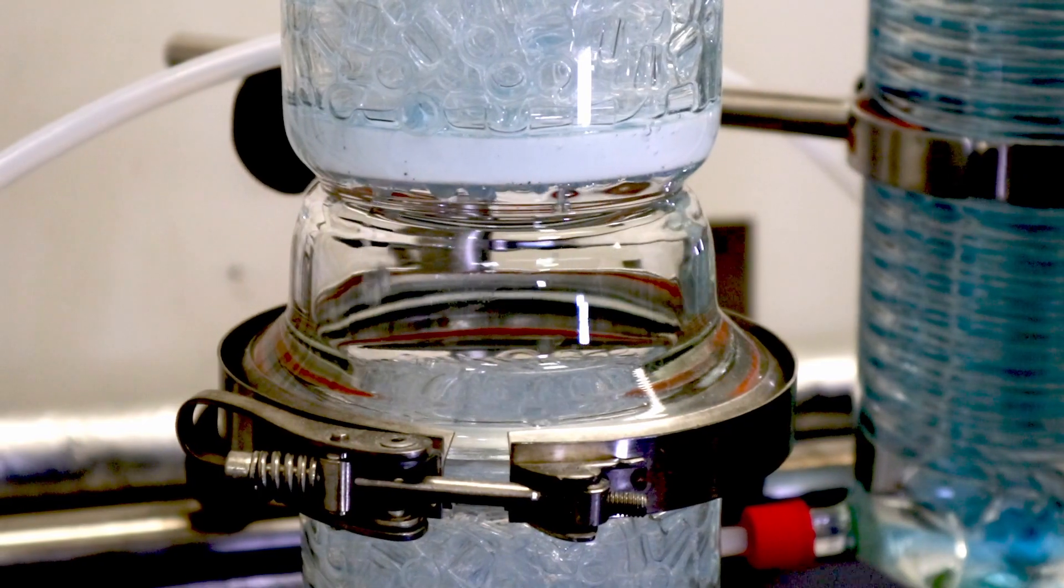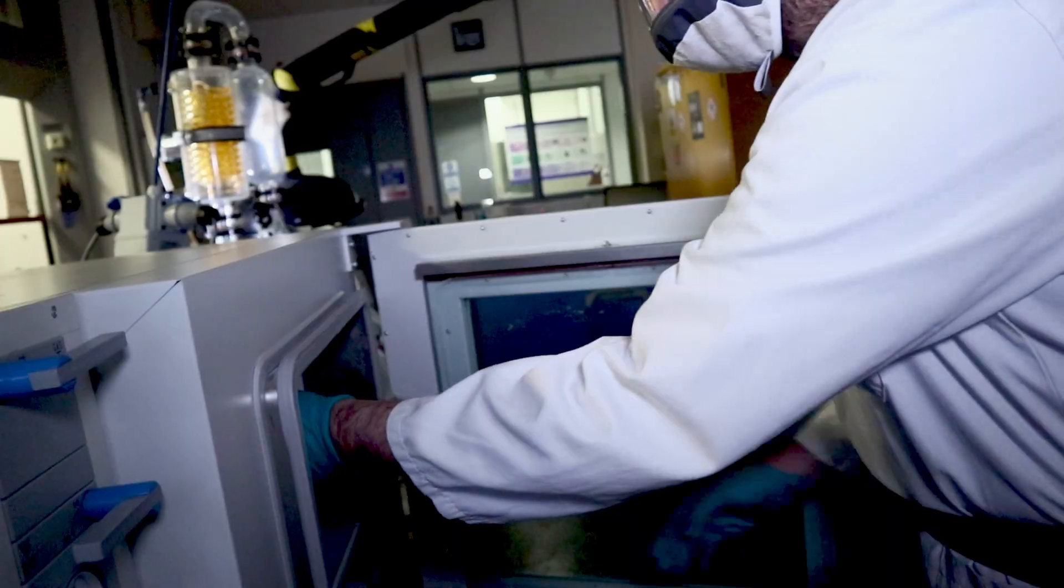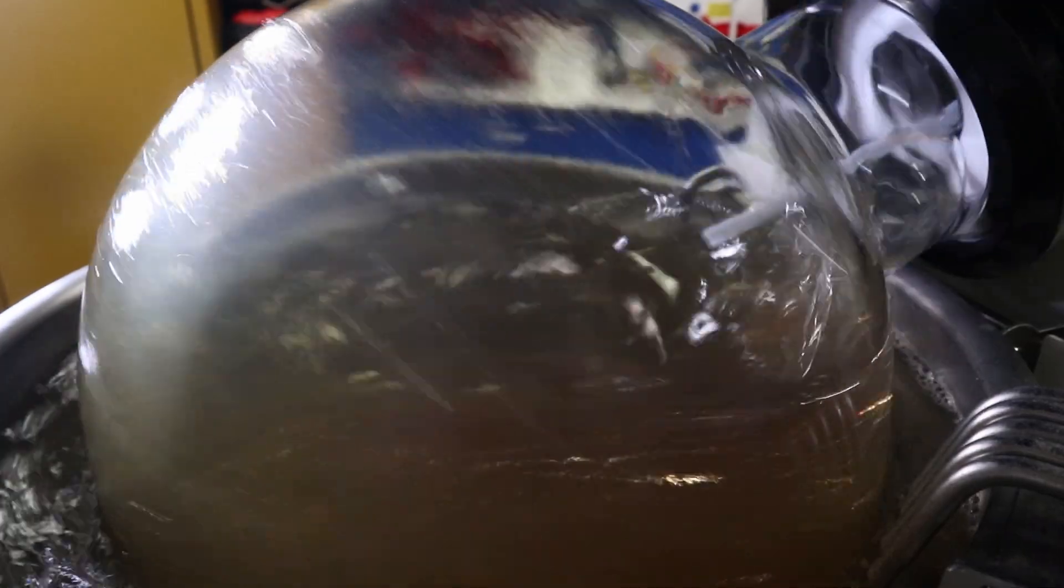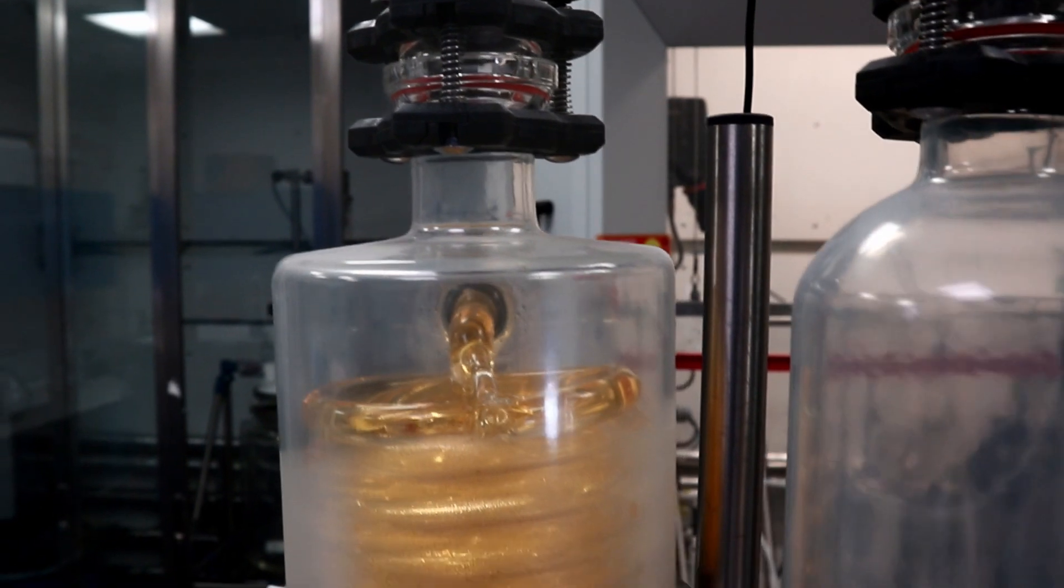Our team has worked on a range of projects and molecules ranging from very small to very large molecular weight molecules, such as antibody drug conjugate intermediates, as well as proprietary polymers and dendrimers.